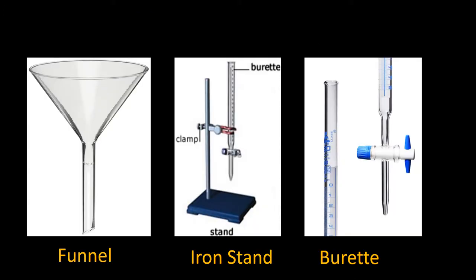Now this is the funnel. We place the funnel on top of the burette so that any solution we add to the burette does not spill to the sides. And this is the burette, mounted on the iron stand on which we hang the burette vertically.